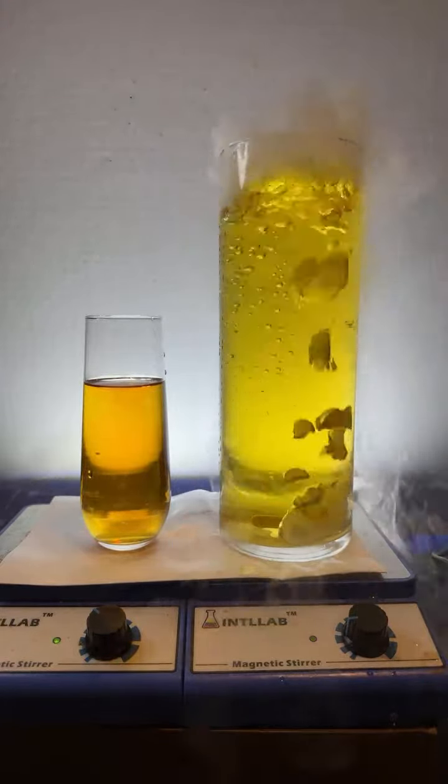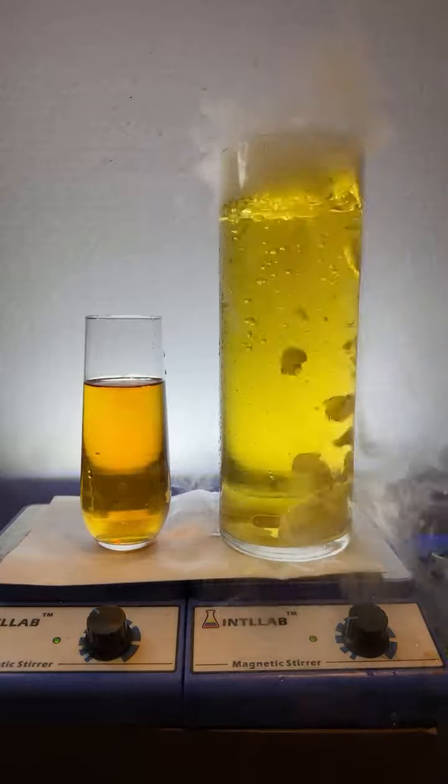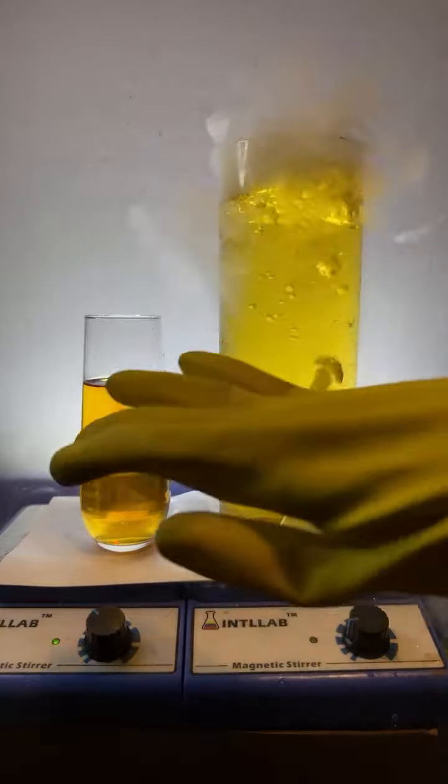The acid I'm adding, Brave, is hydrochloric acid. It's quite concentrated, which is why I have the gloves on. That's why I'm taking them off.